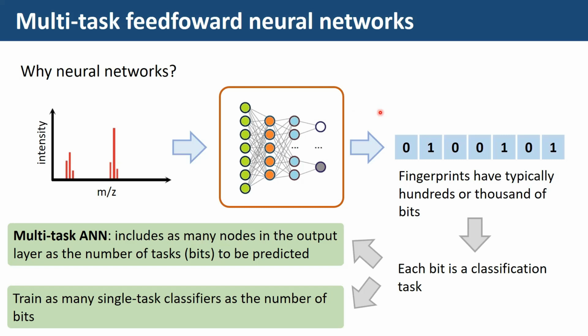We range scaled the mass spectra between 0 and 1, but maintaining the proportion between the peaks in each spectrum, because in this way the mass spectra were comparable to the weights of the neural network. But we didn't start from the chromatogram, so we just got the mass spectra as starting data for our modeling.